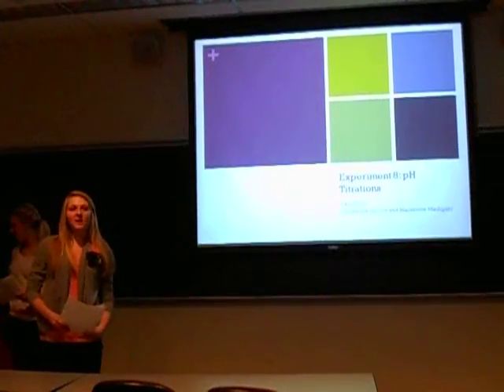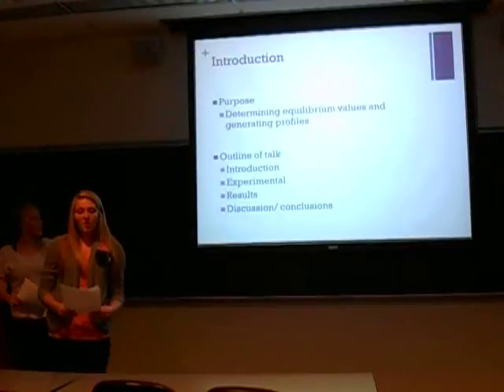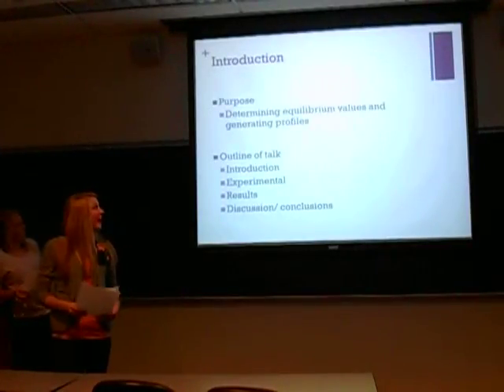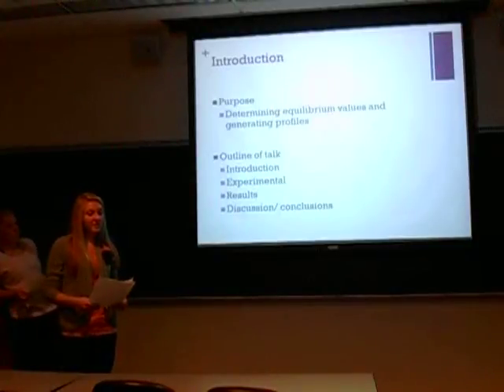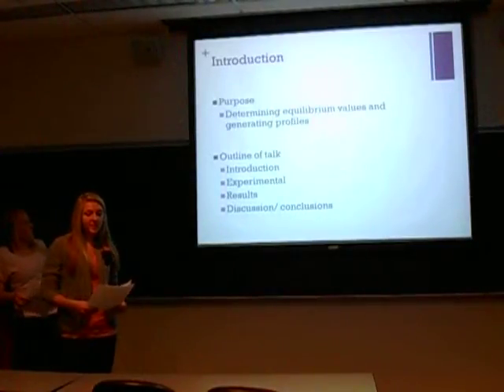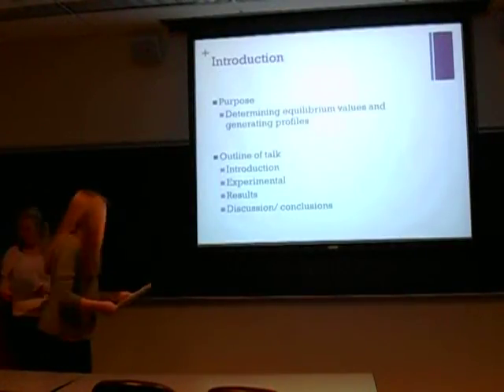The lab was to determine the pKa, Ka, and molecular weight of an unknown weak acid. Along with this process, we were generating pH profiles of titrations of strong and weak acids with a strong base. This presentation briefly outlines our procedure, states our experimental results, and discusses the conclusions we found.